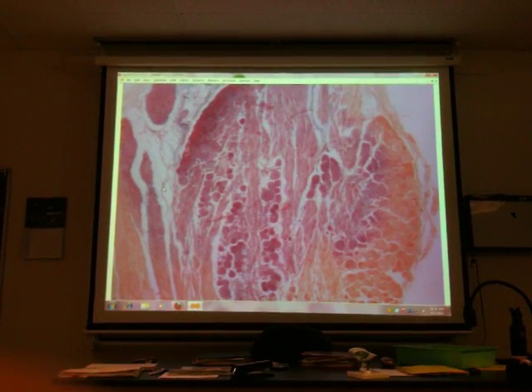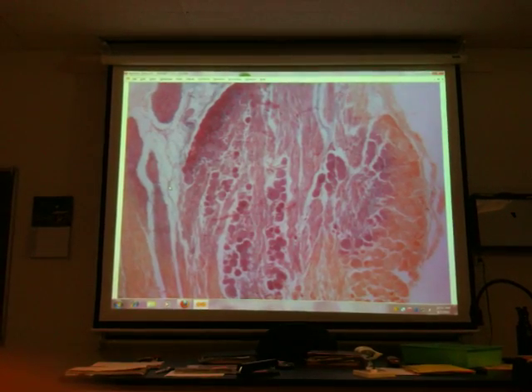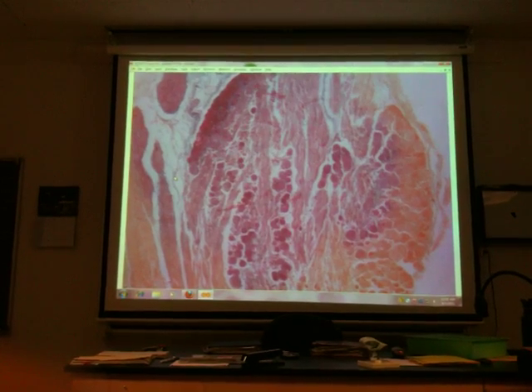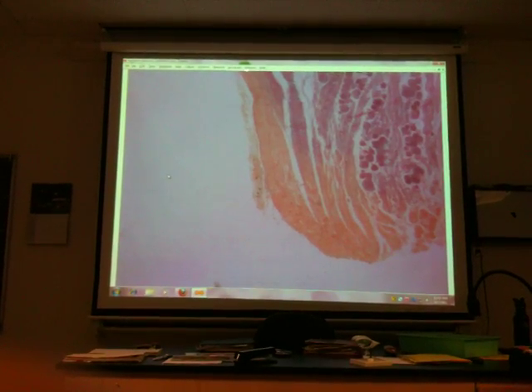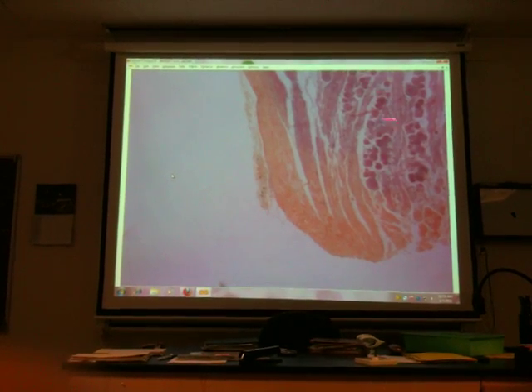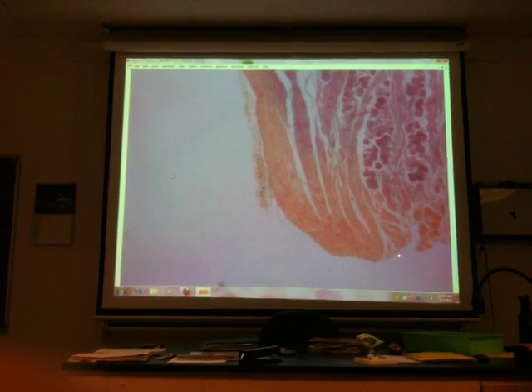Okay? So we're doing a lot of review beyond the scope of Tuesday's test up to the scope of lecture content on the exam. You guys okay? So we're about done. The ventral root does not show well. This is the ventral root coming in. It merges with the dorsal root just beyond the dorsal root ganglion.